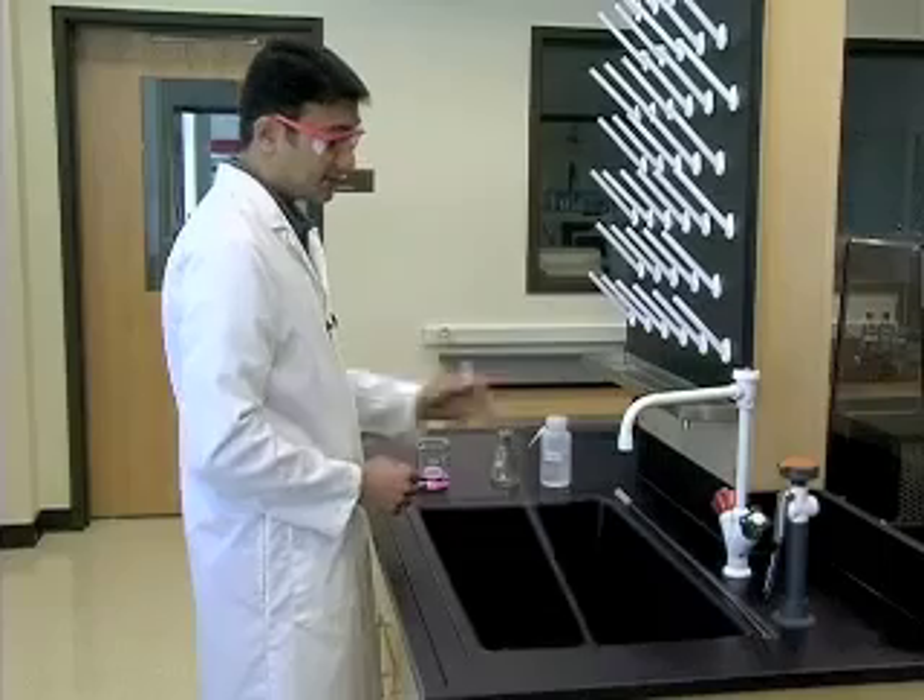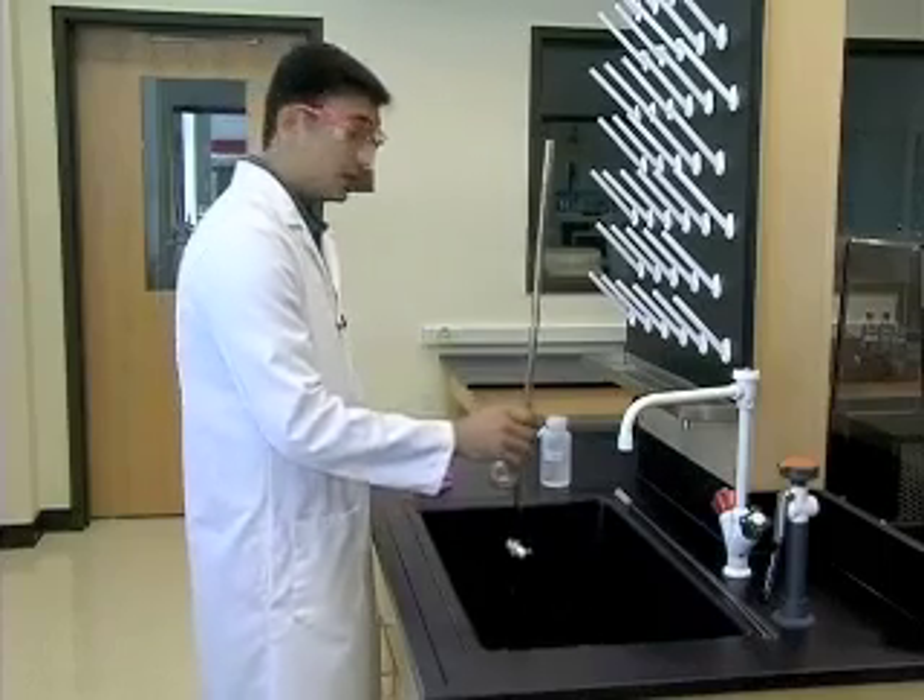Also pour the excess titrant, which is inside the buret, into the waste beaker.